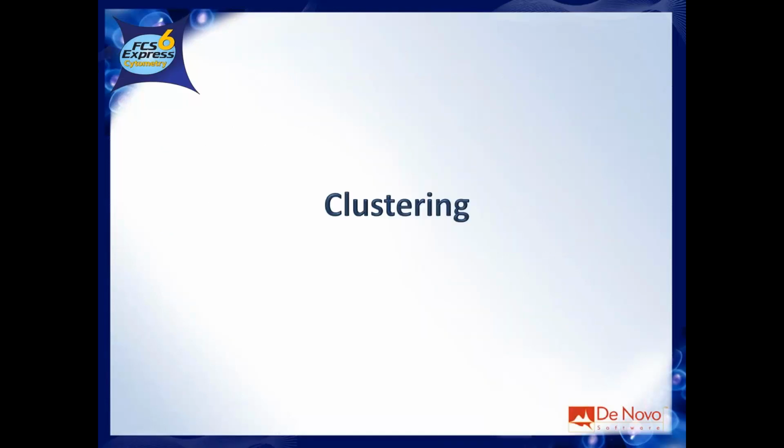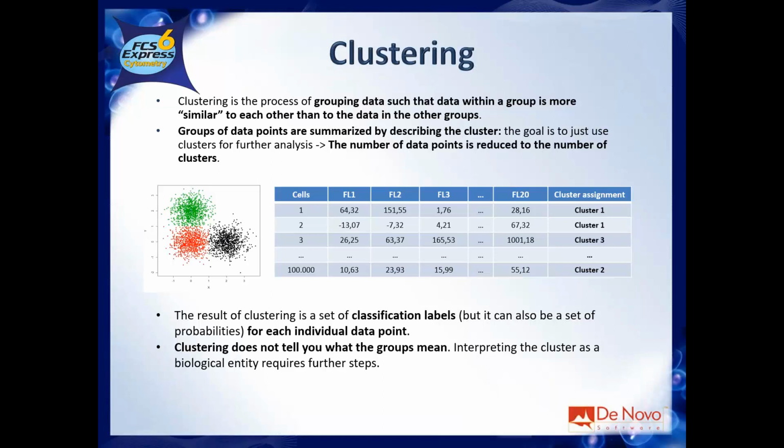What about clustering? Clustering is the other approach that you can use to simplify your data set. Dimensionality reduction reduces the columns, let's say, of your data set. Clustering reduces the rows, so reduces the observations. Instead of dealing with 100,000 cells, like in this case, you will end up, I don't know, with 10 clusters, 100 clusters, no matter. The number will be much smaller than 100,000.